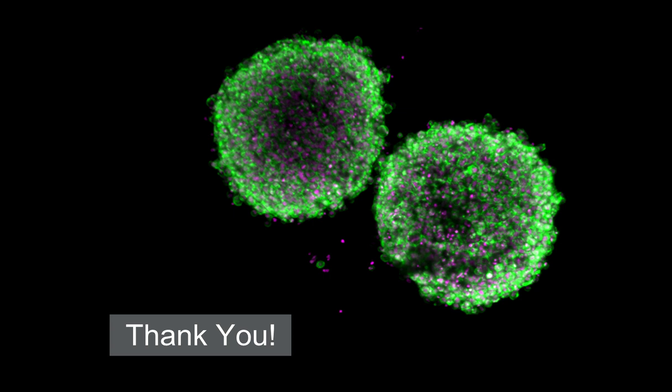And so we've really found in our lab that using these treated Nunclon Sphera plates, essentially we just aliquot our cells into every well and incubate overnight, and we have the nice round spheroids that are consistent and regular balls of cells for our models. So definitely recommend looking into those.